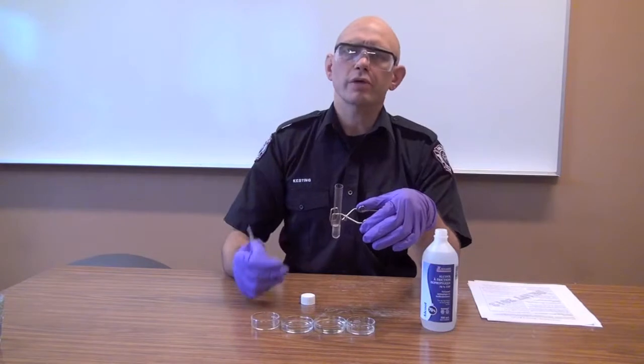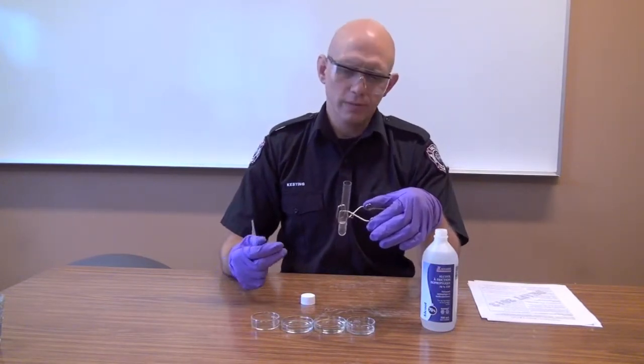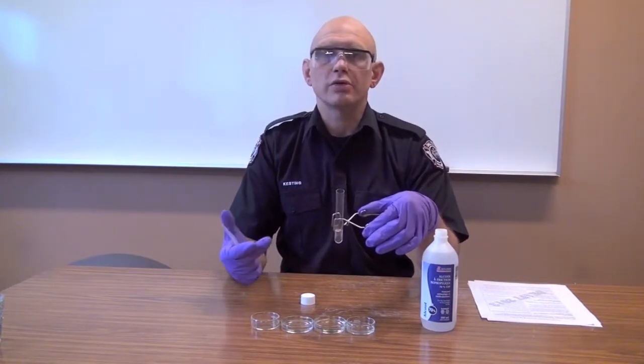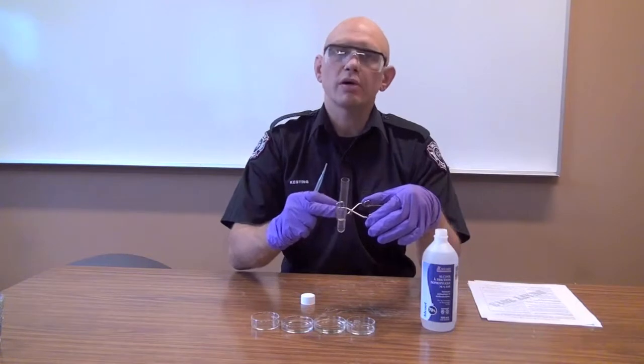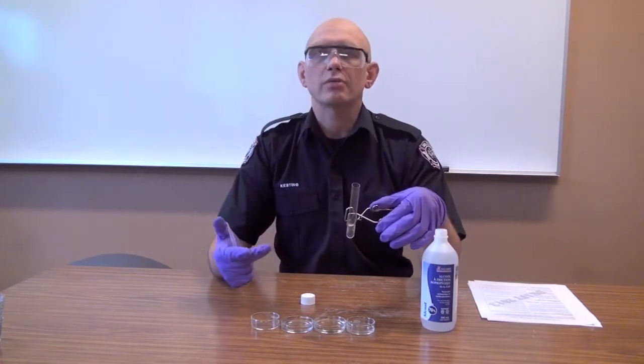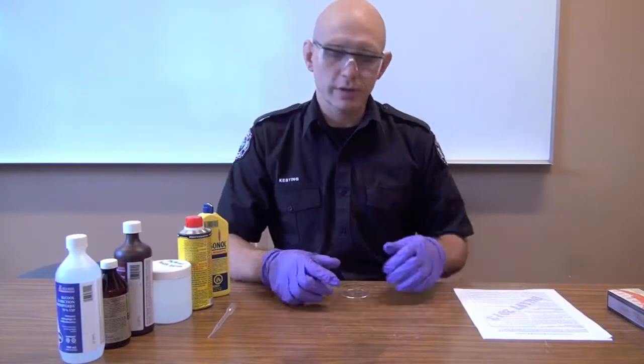So now we know it's not water reactive, the specific gravity is less than one, and it's miscible with water — these are useful things. If we added an oil, a diesel, or an unknown hydrocarbon, it might well float at the top of the water and form a really distinct boundary, which would also be useful information.